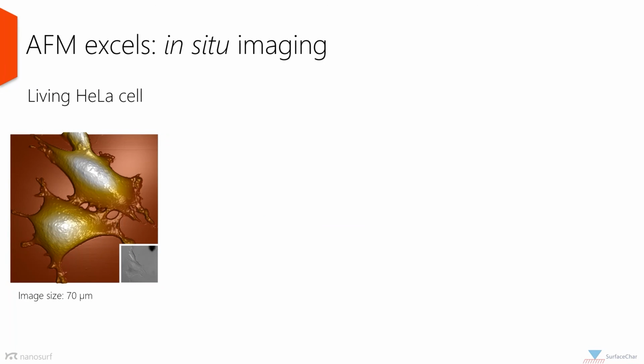Now we leave the electrical measurements and come to in-situ imaging. In-situ for AFM mostly means that we are measuring in a liquid environment, for example, for electrochemical experiments, but as the examples here will show, also for working with biological material, in which we need to have the material properly hydrated to keep it alive in the case of cells, or to keep it functional and keep its proper structure, as in the case of some other examples I will show on this slide.